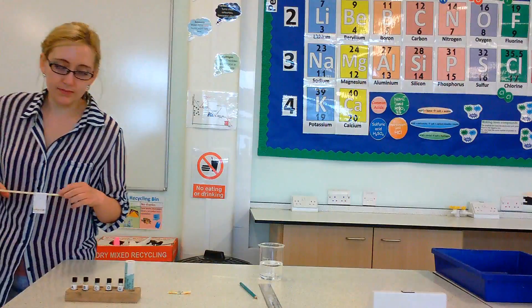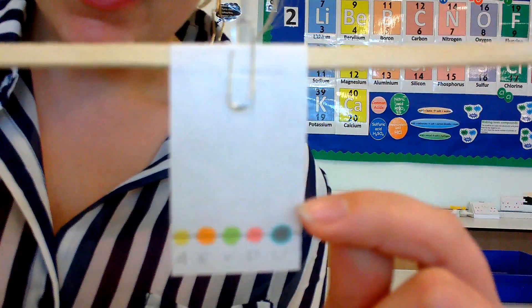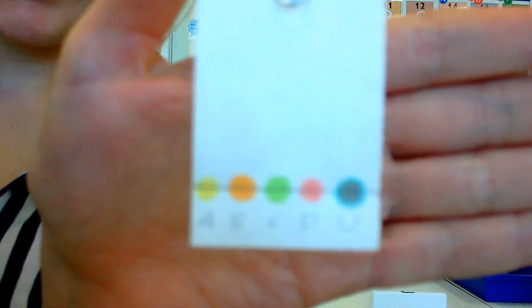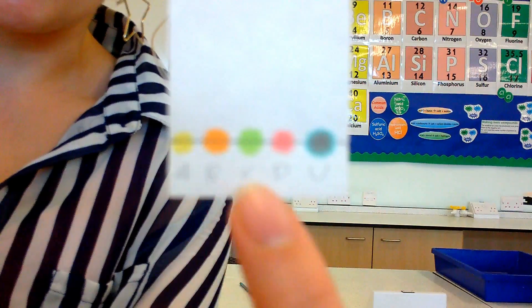I've already drawn on my little slip of filter paper. I've got a pencil line down the bottom. I've also written out underneath A, B, C, D and U so I know which splodge is which. And I've done a splodge of each of the inks.